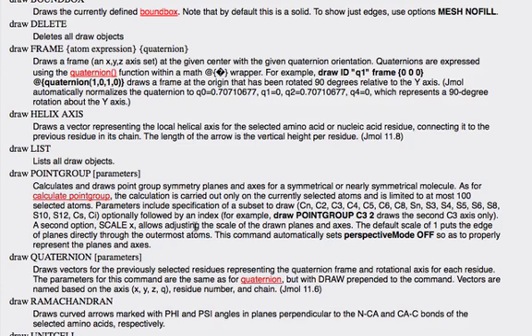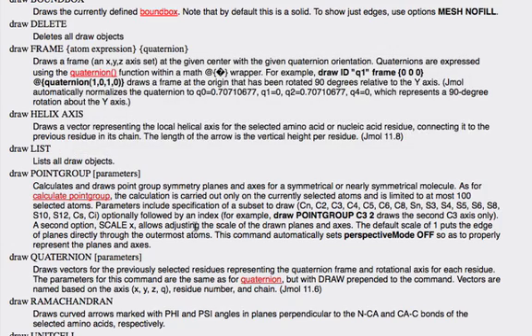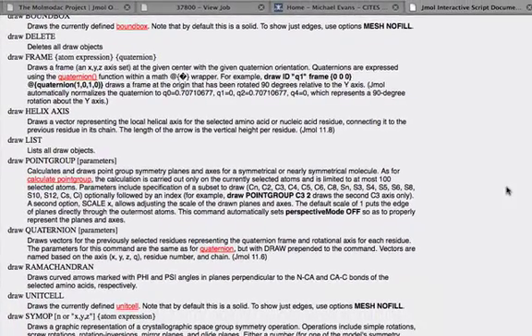One thing you should keep in mind while drawing objects using JML is that every object has a name, and this includes isosurfaces and molecular orbitals as well. You can assign a name to every object you draw as the first parameter of any command you issue. If you don't specify the name of an object, then every time you try to draw a second object of the same type, the first object will get replaced.